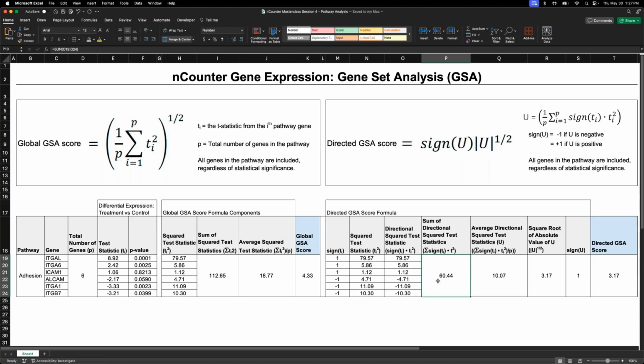And then just like I did on the left-hand side, I want to take the average of this value. So it's 60.44 divided by the total number of genes in the pathway, which happens to be 6, and that's 10.07. So what I just showed you is what's represented in the parentheses here. I know it gets a little confusing if you're not used to this type of nomenclature, but that's exactly what this is trying to represent for you. So everything in this parentheses here is equal to 10.07, which in this formula they call U as their default here. So they're calling this value U. And so now we have U here.